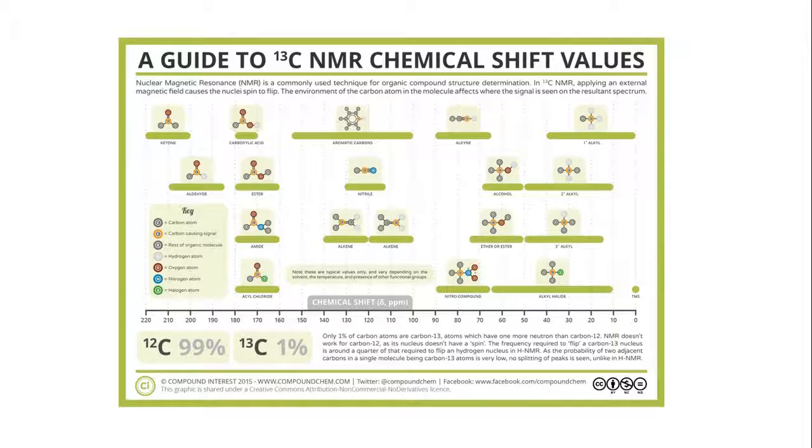Then when we look at our Compound Chem sheet, we can see that the first amide does match up with the peak furthest to the left. We see our amide here, and it shows up in roughly the same place. The other peak is most likely some kind of alkyl. It could really be any of these because it overlaps. So this is why it's good to pair it with H-NMR, because it can be difficult to get all of the information from just one of the graphs.